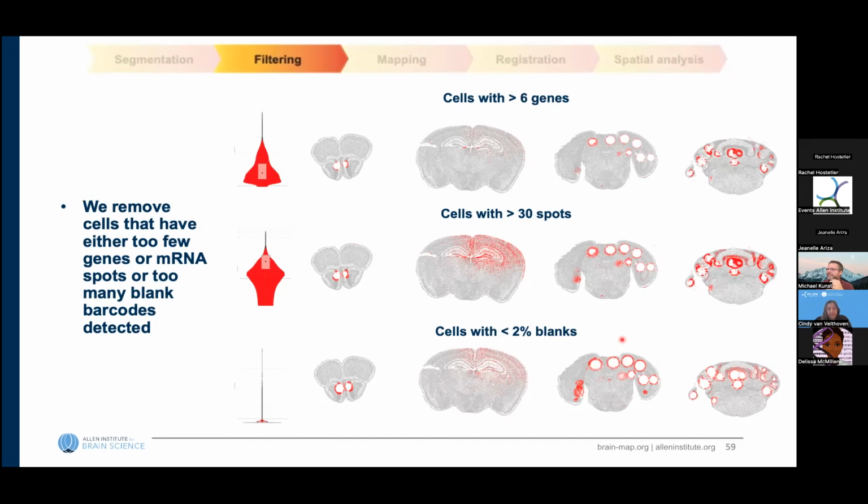In this case, two things helped. One is we can look at the distribution of cells in the tissue, since we're using spatial transcriptomics. And we also have certain areas where we know that some tissue problems arise from our earlier data. So we can start plotting the distributions of all these different values.